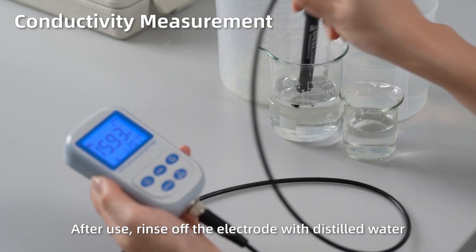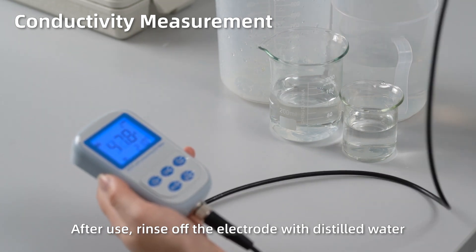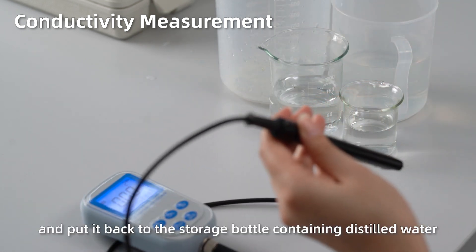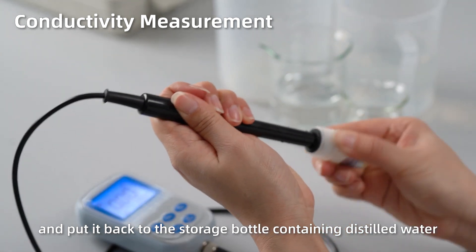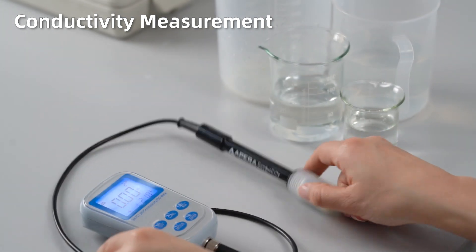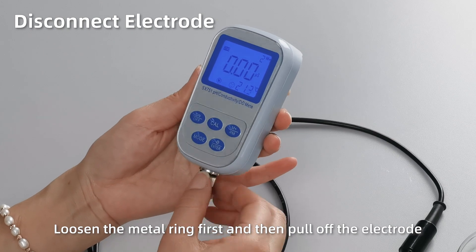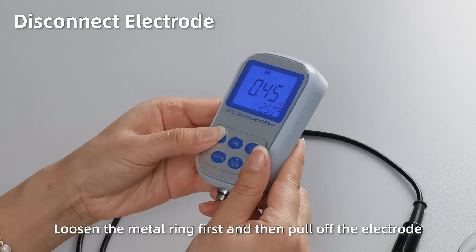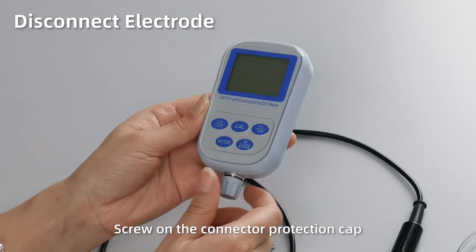After use, rinse off the electrode with distilled water and put it back in the storage bottle containing distilled water. Short press Off to power off. Close the connector protection cap.